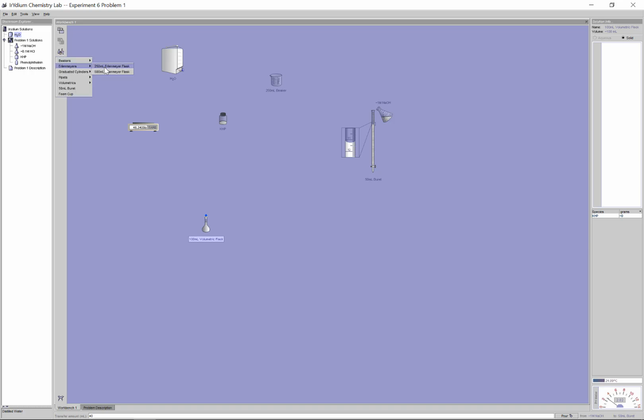I'm going to try to demonstrate for you this 3 times. So let me just pull out 3 Erlenmeyers. They come in different sizes as well. I'm just going to take the smallest one that I have. And what I'm going to do is transfer this acidic standard here into these 3 Erlenmeyer flasks.